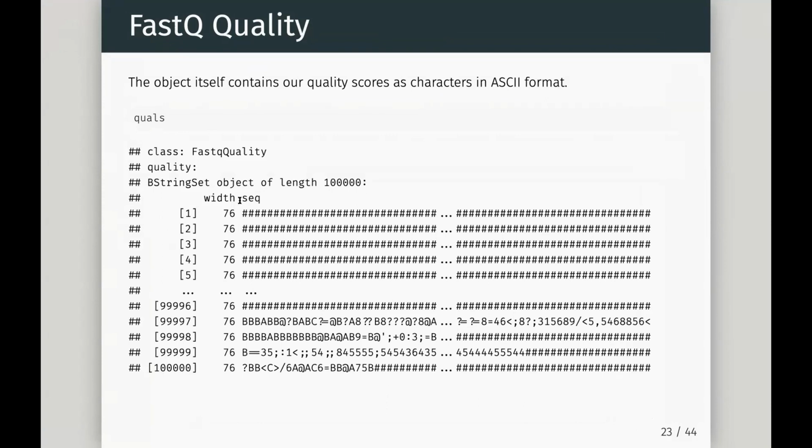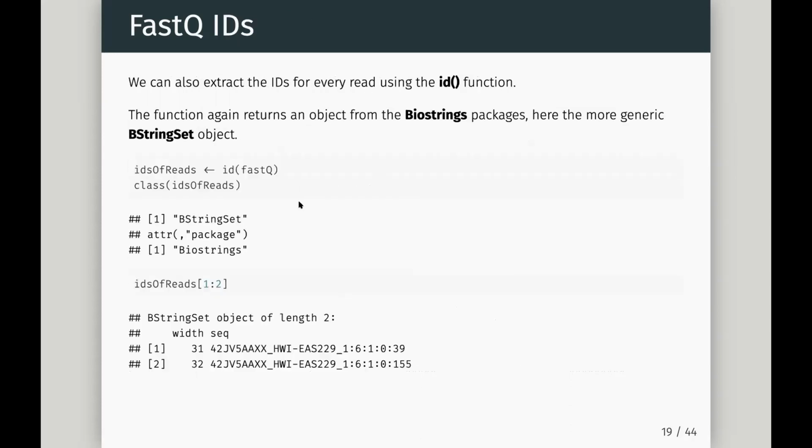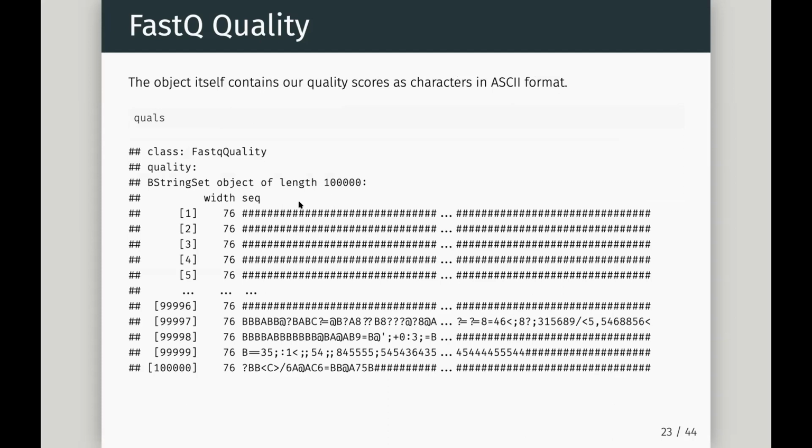I just said, hash tends to be a very low quality. So you can see these first reads where we had mostly Ns, but we weren't sure of the actual bases. Typically, you expect those to be very low quality. You can see here we have same length, same width, but very low quality for the original sequences in this file.